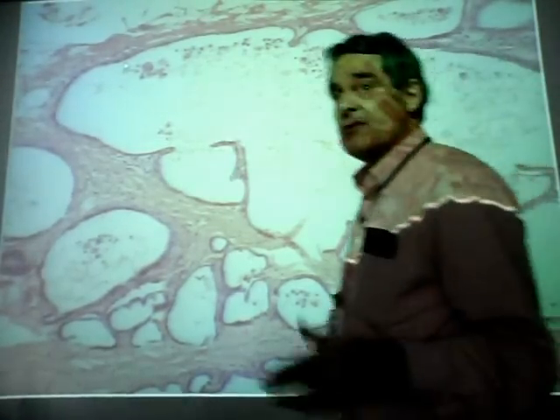So here you have a lactiferous duct. Okay? And then just before the lactiferous duct passes through the nipple, there's a slight swelling. That's called the lactiferous sinus. You can see it very nicely on those breast models. Okay? And in fact, questions on the breast I'll probably ask not from the slide, but from the model. Okay? Any questions? Okay, that's it for the slides.